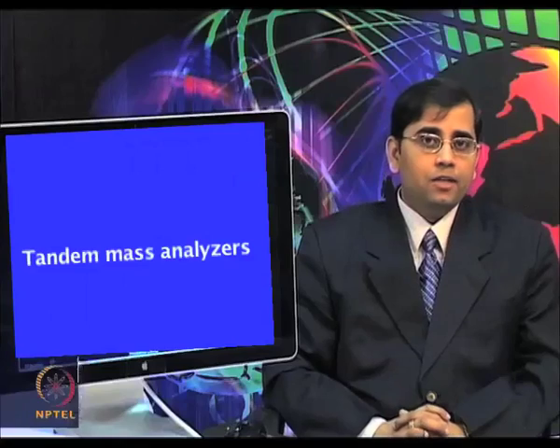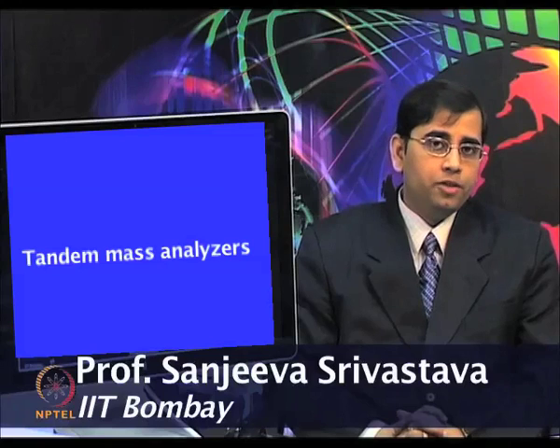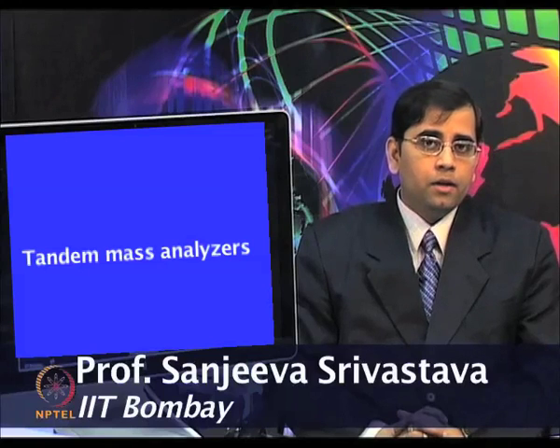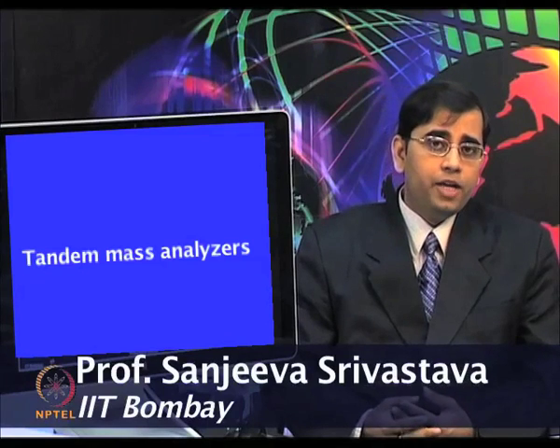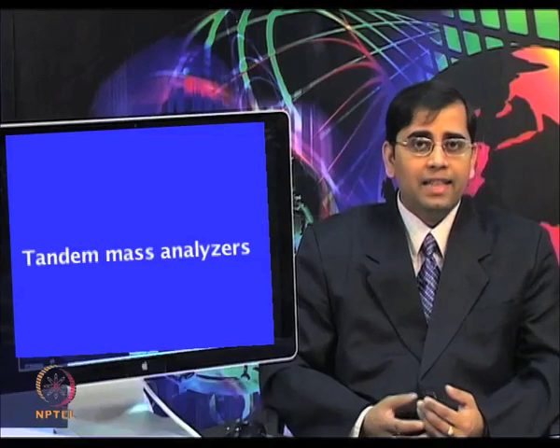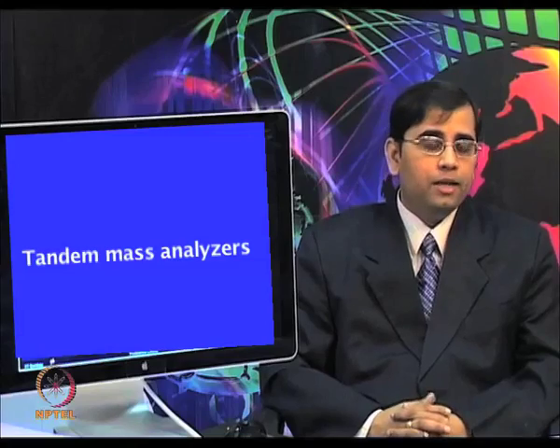So, we have discussed all the important components of liquid chromatography and mass spectrometry. Now, one can apply these configurations in tandem. One can select different types of mass analyzers and use them based on their applications. So, now we will look at some of the popular hybrid MS and MS-MS configurations.